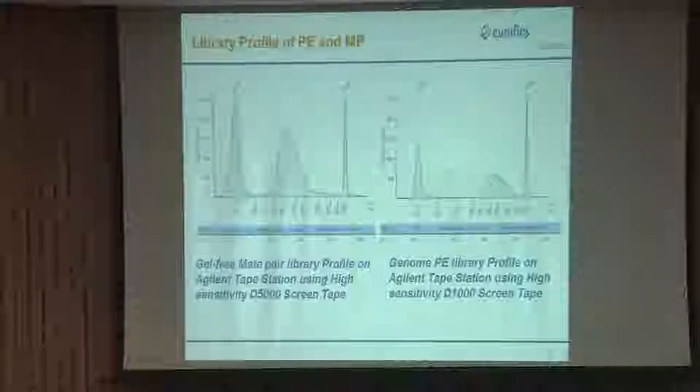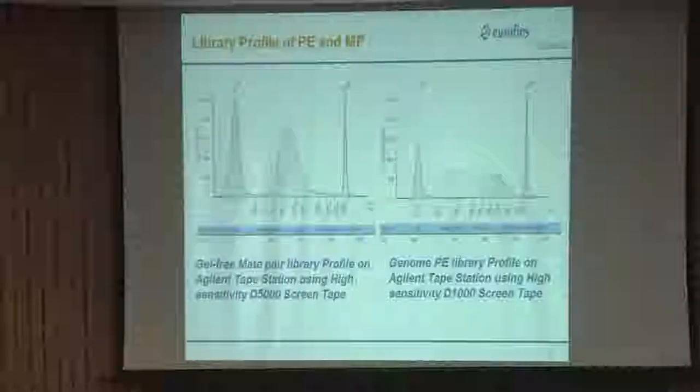So the library profile looks like this, wherein this is where the library is. In this case, I have a library of approximately 814. This is a mate pair library, a bigger library with a longer insert in it, right? If I have longer gaps in my assembly, or repetitive regions in my assembly, this type of reads can resolve it because it has a gap between them. So what happens in the assembly? It will consider this 814 minus 120, because 120 is my adapter straightforwardly. So that goes off.